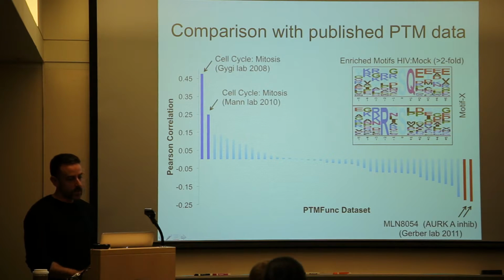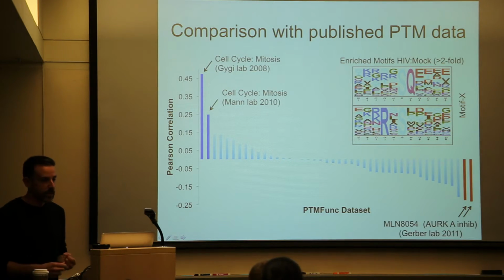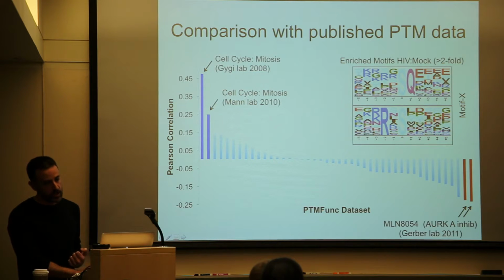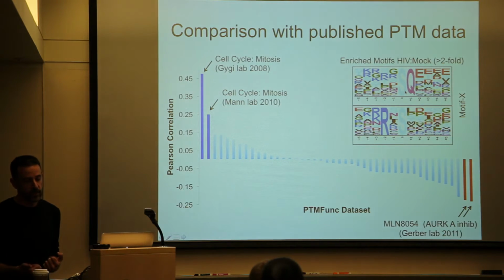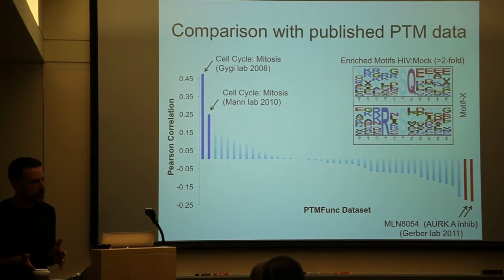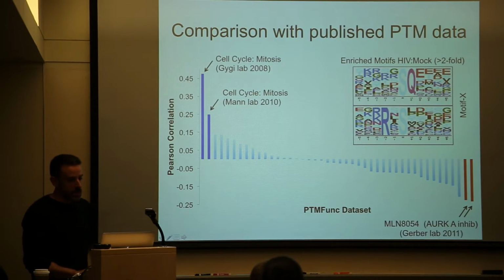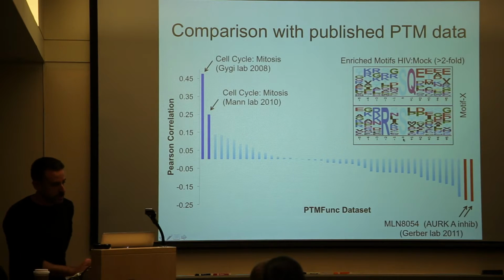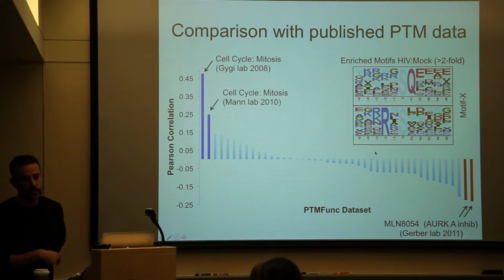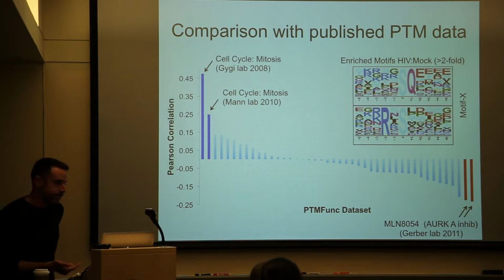In terms of the motifs that we pulled out of our data, and again, this is another tool that's very good for phosphorylation, we found there were two motifs that were enriched. The first is an SQ motif, and that's again this cell cycle arrest. It's the ATM-ATR recognition motif. But the second one, this R in the -2 position, and there's actually an RRK in the -3 position also, that's consistent with aurora kinase A phosphorylation.